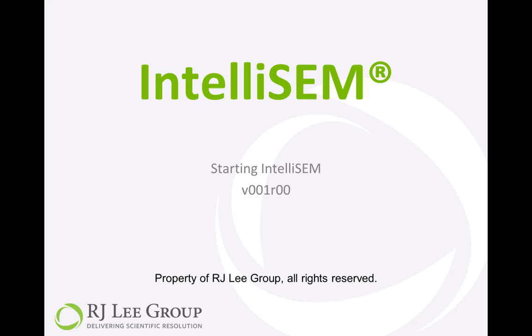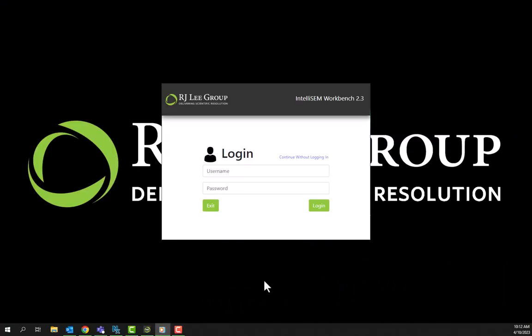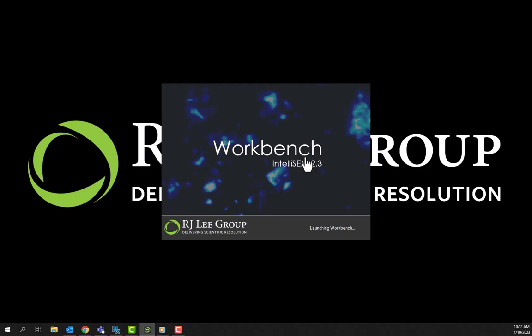Hello, this is a video on how to start IntelliSEM and a brief overview of the home screen. After starting IntelliSEM, you may see a login screen. If your system is configured for user authentication, enter your credentials here to log in. If your system is not set up for authentication, this screen will not appear and IntelliSEM will start directly.